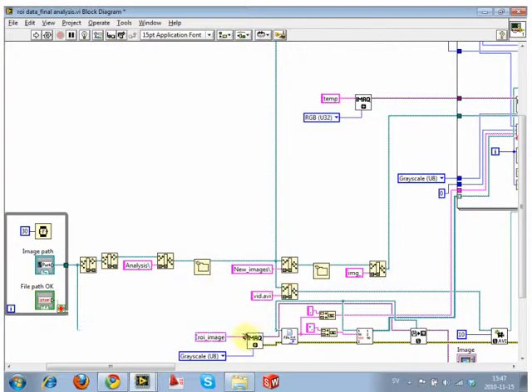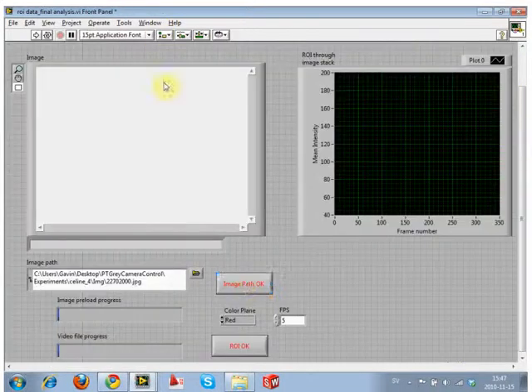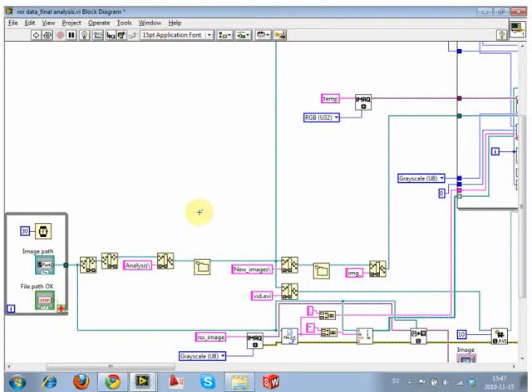One other thing that you might have noticed is that I switched out the filter, because I was looking at a lot of data sets, and it was only about half of the time where you actually needed to specify what your filter was, but there were other file names in there. So there are text files, LEI files, etc. So you actually more want to filter based on file extension than on some file name. But we can use this VI, which strips the file extension out, to essentially filter our files.